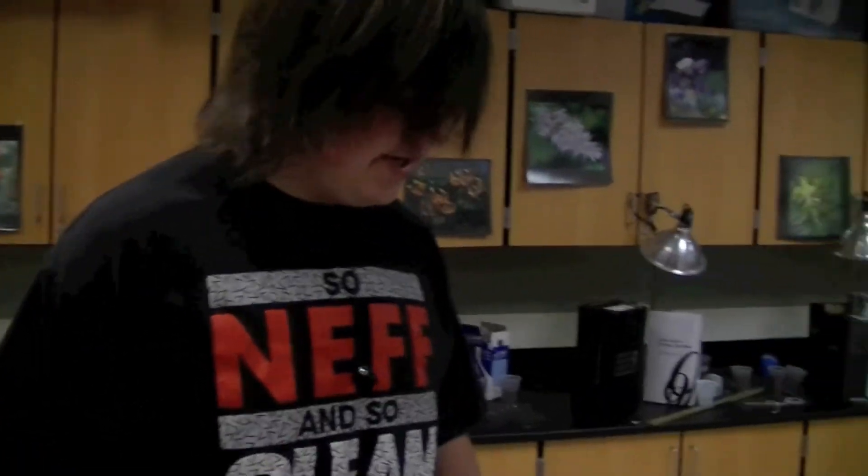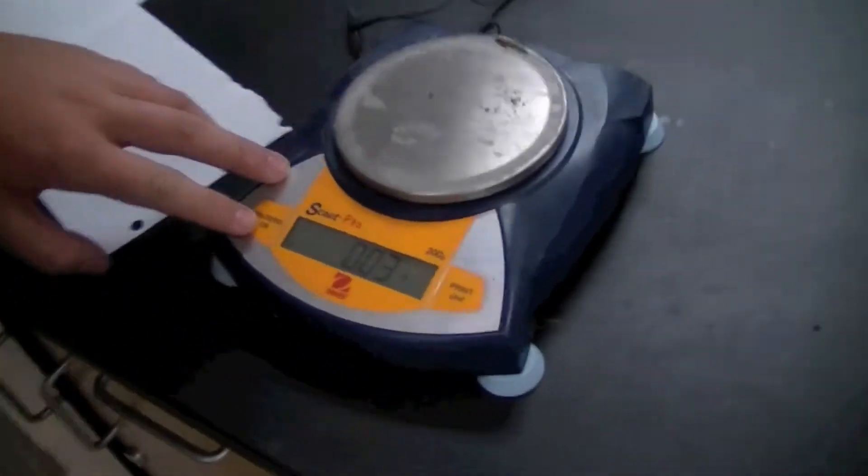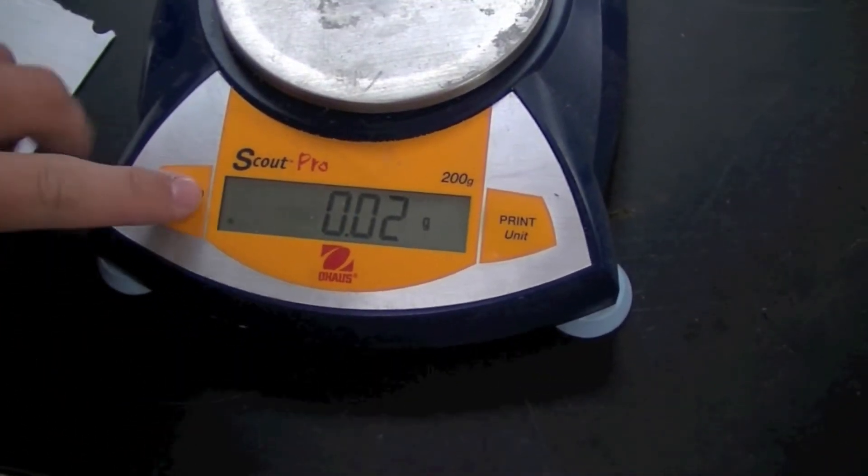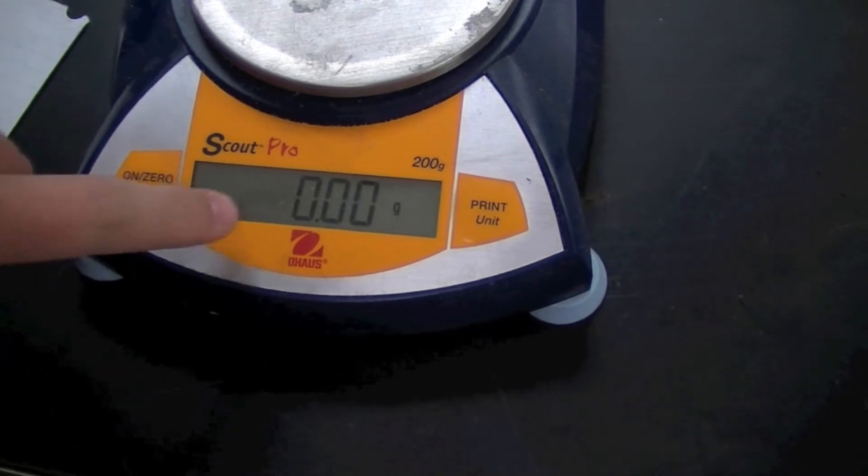The next step, you're going to need to make sure your scale is set on zero. As you can see, there's nothing on here, but it's set at 0.02 grams. If you hit the zero button, it rebalances.